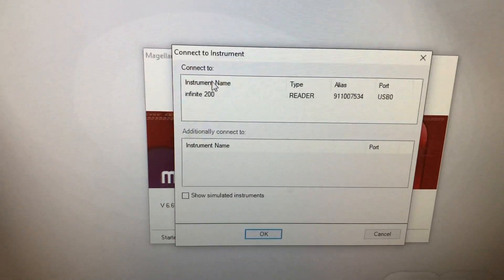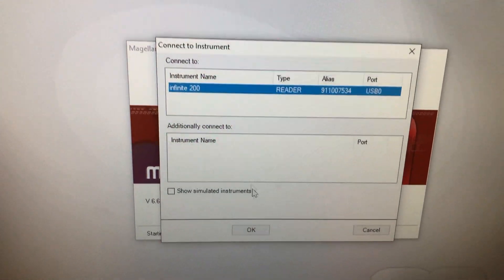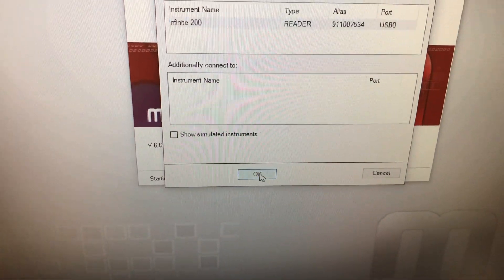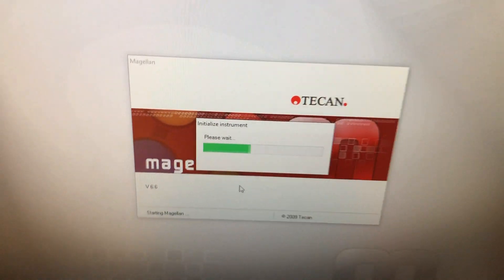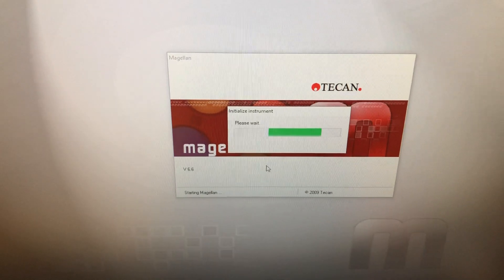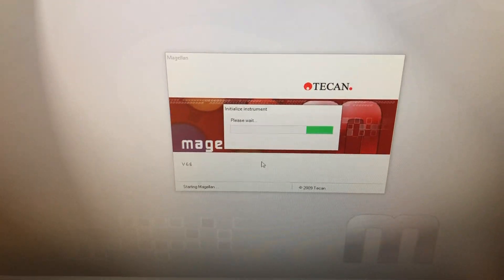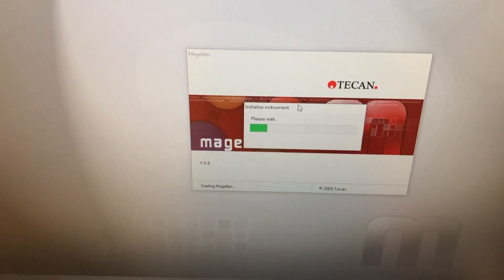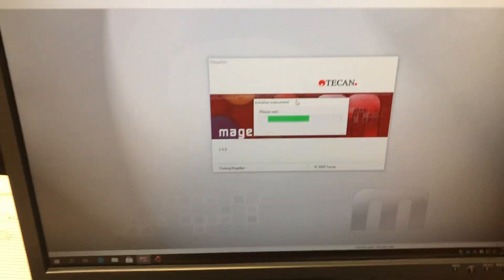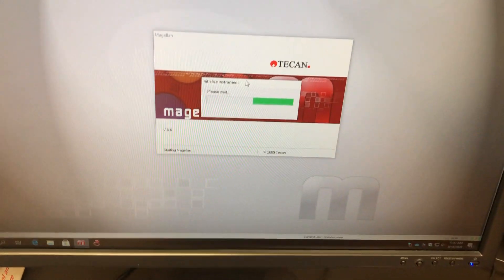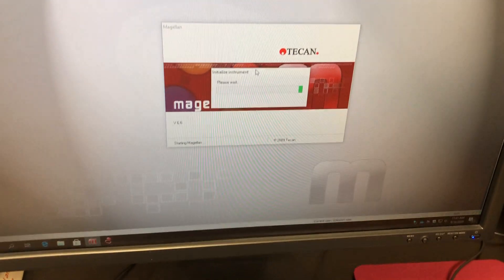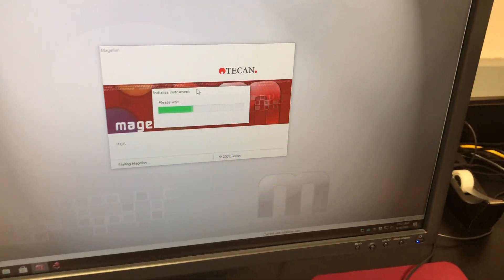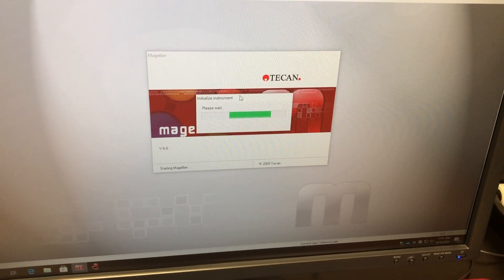Press OK. Now you're on the instrument. And again, you see that M200. Press OK. After selecting it, we'll go ahead and load up here. It's not the fastest machine, so loading the software - that's why I already have the software loaded. Sometimes it can take a little bit of time. And then, actually, lighting the instrument can also sometimes take a little bit of time.